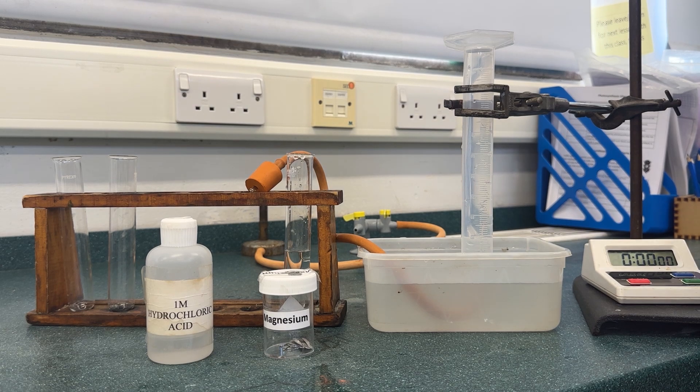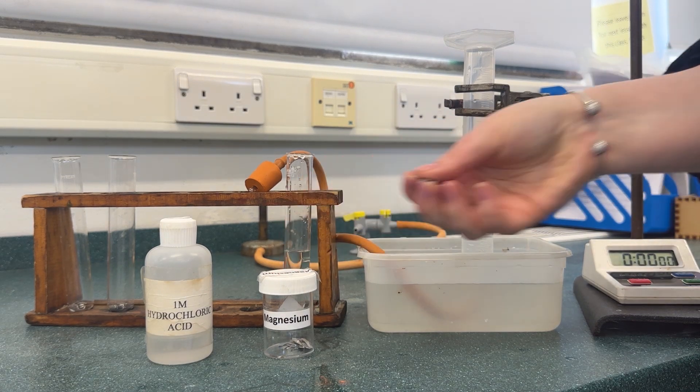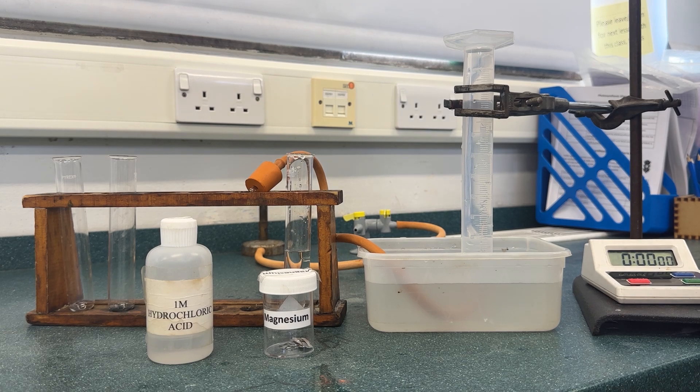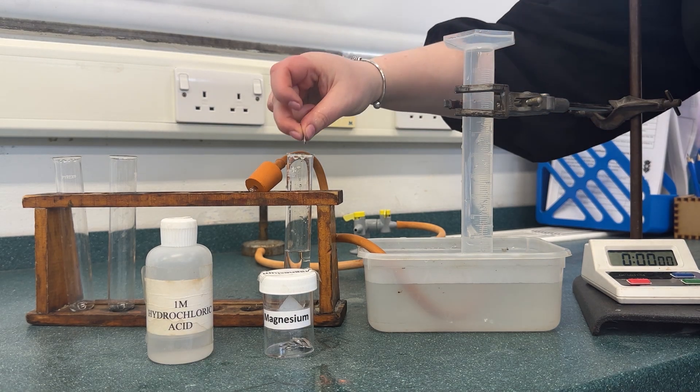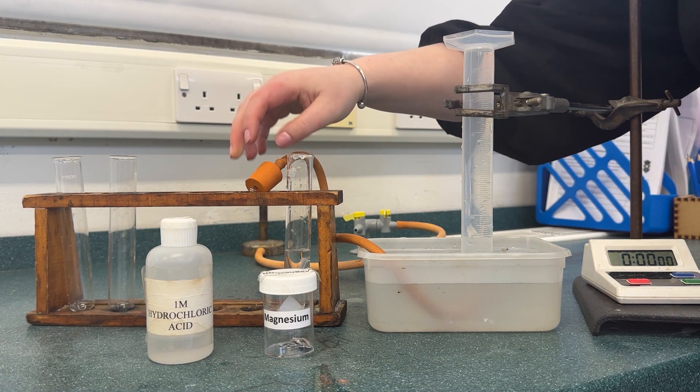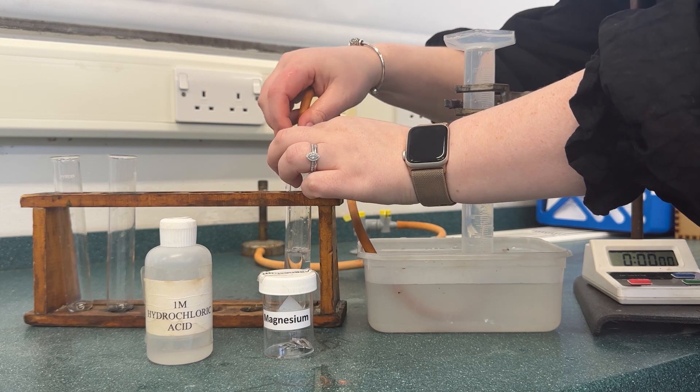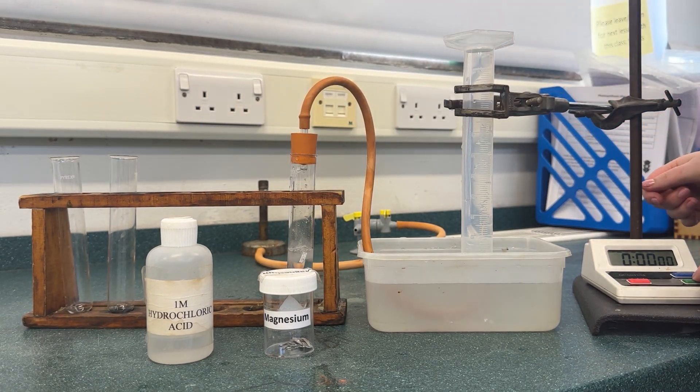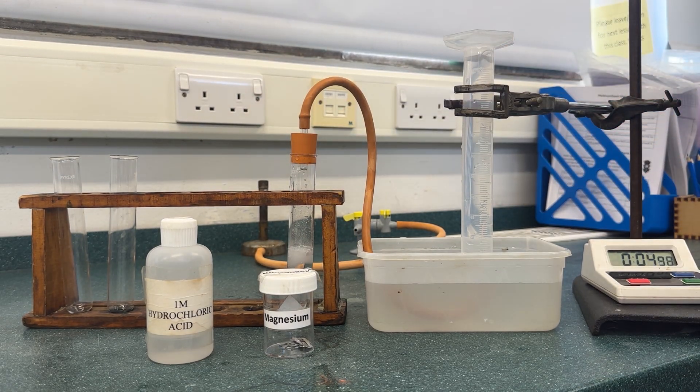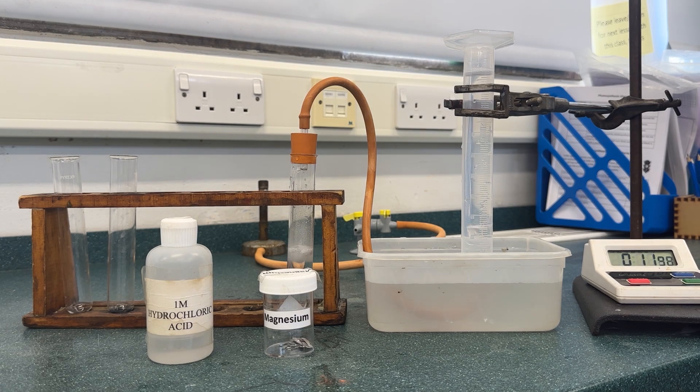To carry out this method you need to have your reactants ready to go and have your delivery tube underneath your measuring cylinder of water. Here you can see I'm going to add the magnesium to the hydrochloric acid and then I'm going to stopper the delivery tube very quickly and start the timer whilst we're starting to collect the gas. From this point you want to read your measuring cylinder at set time intervals.